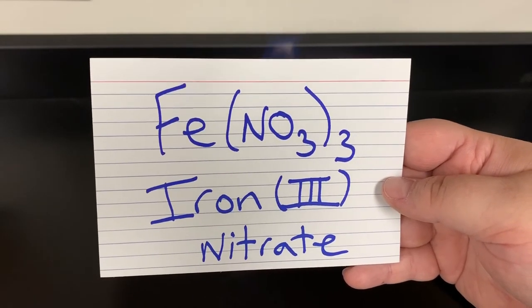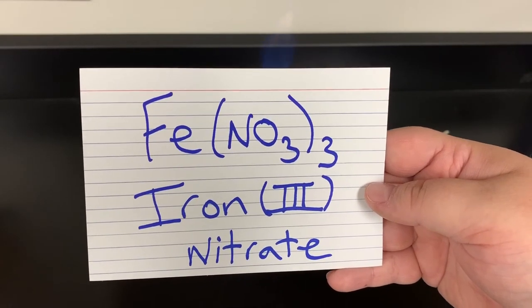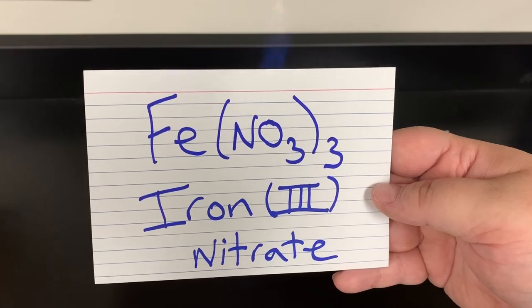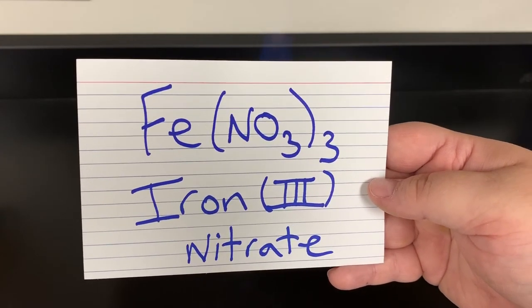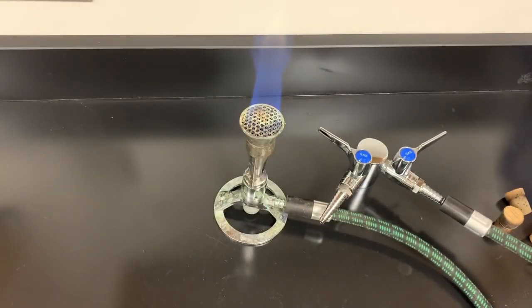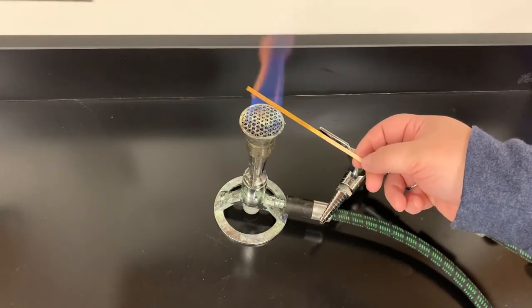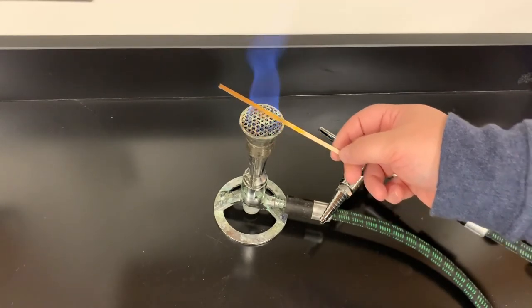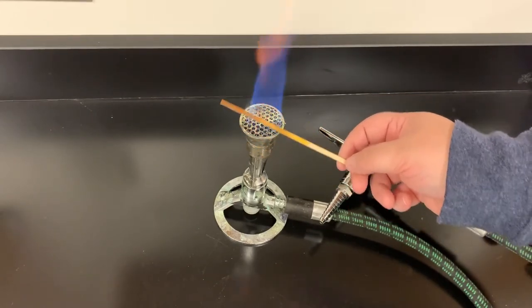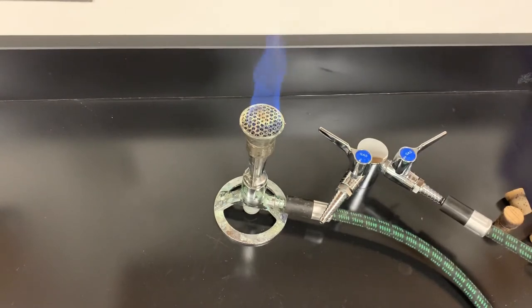Next one is Fe(NO₃)₃ — iron(III) nitrate. The Roman numeral three means it takes on a positive three charge. When I put it in the flame, it really doesn't do anything. Sometimes there are a couple of little sparks, but it doesn't change the flame color — that's a dud.